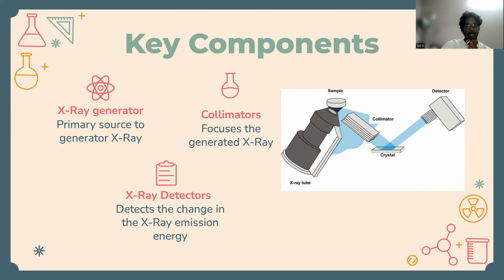Another thing to remember is that during the analysis, the analyzer emits a directed radiation beam when the tube is energized. A reasonable effort should be made to maintain exposures to radiation as far below those limits as is practical. This is known as the ALARA, as low as reasonably achievable, principle. Three factors will help minimize your radiation exposure: time, distance, and shielding.